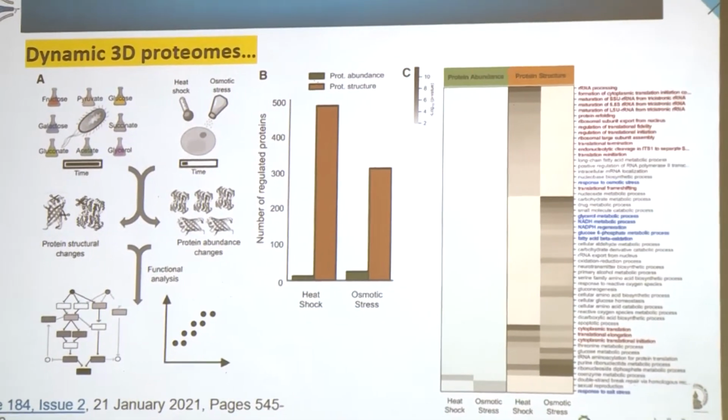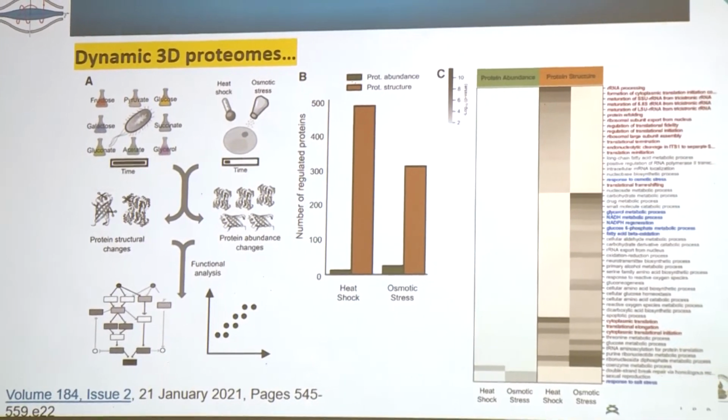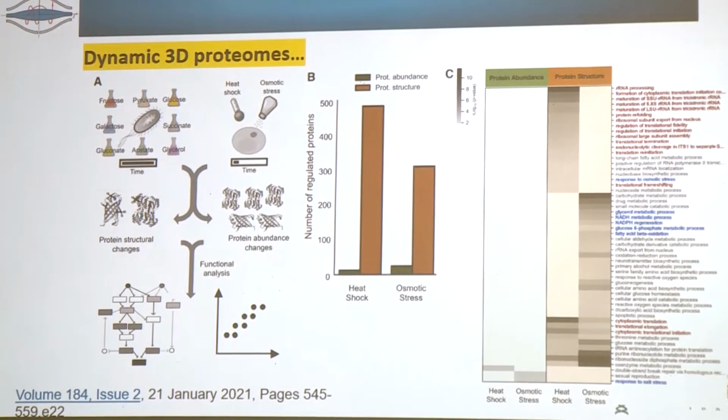And for example, this is another example from this year. They try to analyze the dynamics of proteomes with this system. So what is the idea?